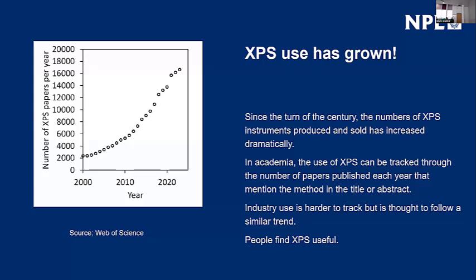There's a large number of users. That comes with some problems as people have to relearn some lessons that were learned many years ago. But the key point is it has to be useful or people wouldn't do it. I think that's a testament to people like Martin Seah, who spent a lot of time making sure that when you have an instrument, you can calibrate it and you can have some level of certainty in the outputs.